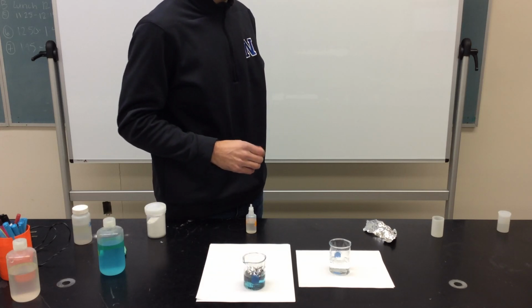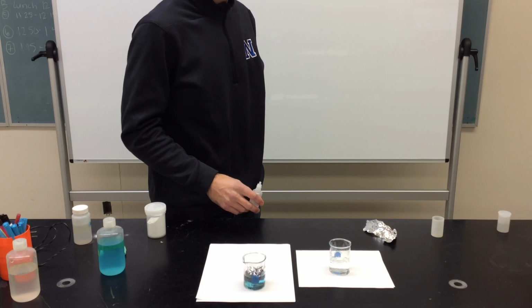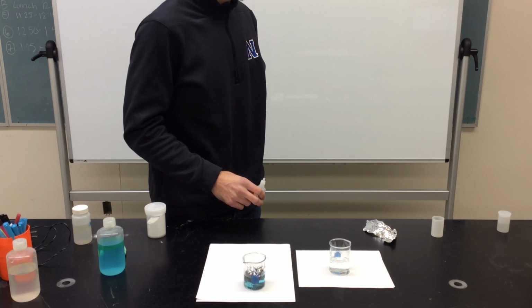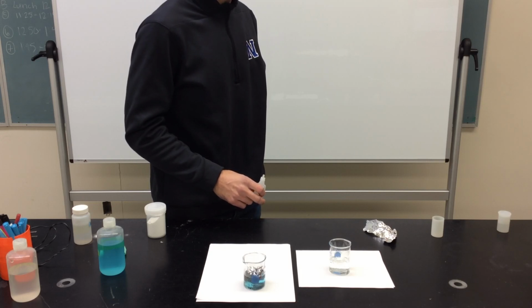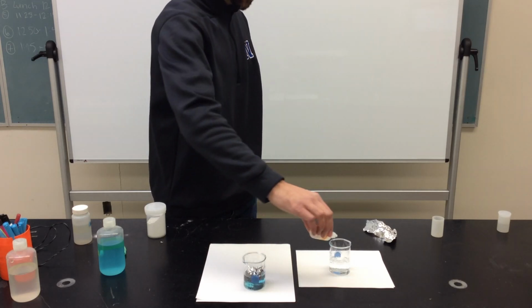Do you think I can do this forever? No, because wouldn't the clear purple solution take up more of the clear solution that you put in before, making it purple? So where's the purple going when it disappears? Is it covered up by the clear solution? Well, let's try it again.